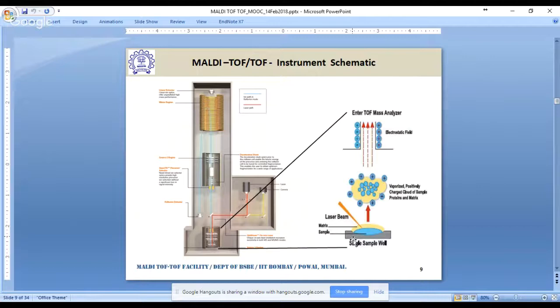As they move vertically upwards, they are detected with the help of a detector, a small camera-like structure present at the top of the vertical cross-section. If the expected molecular weight is more than 5 kilodaltons, then the ions generated are big enough to be separated in this path length and can easily be detected by the detector at the top of the instrument.